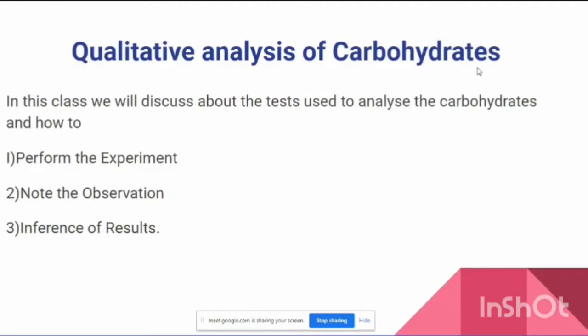So, qualitative analysis of carbohydrates. In this class we will discuss the tests that are used to analyze the carbohydrate starch, how to perform the experiment, how to note the observation and how to give the inference for the results obtained.